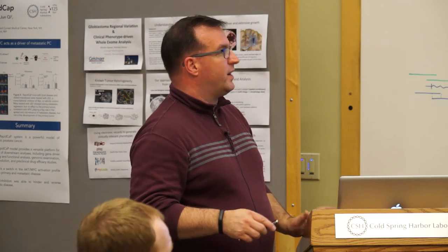Yeah, flow cells. Is what? $1,000. So it's like, okay. But you can run it for 48 hours, total run time. So depending on how many gigabases you need. And yeah, time, that's right. I haven't talked about that, but right.